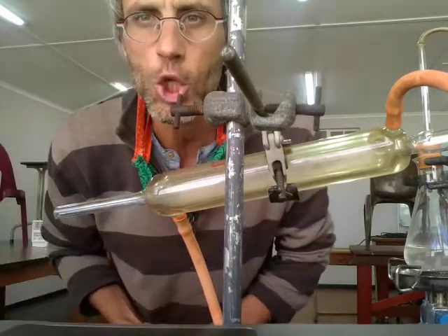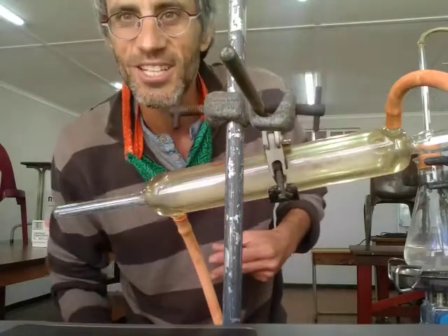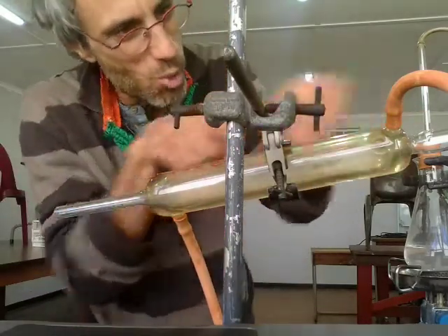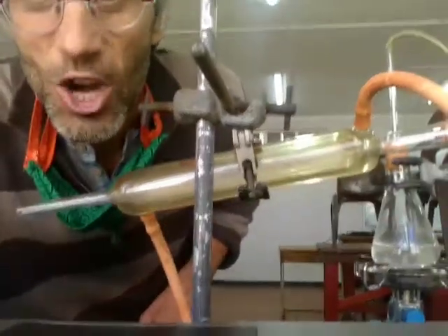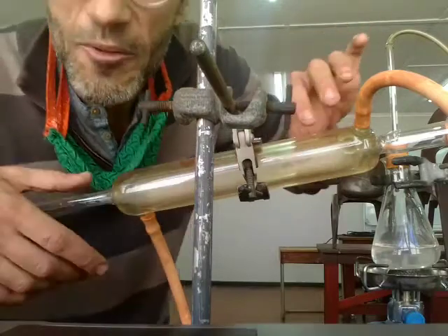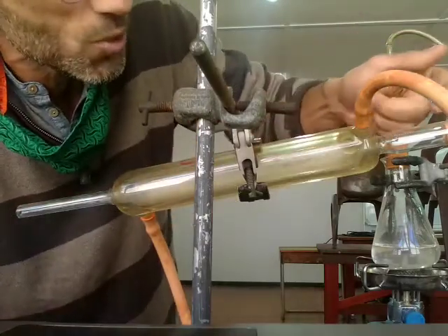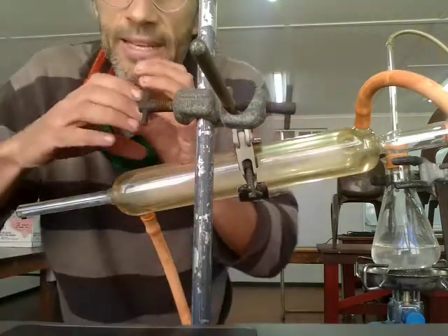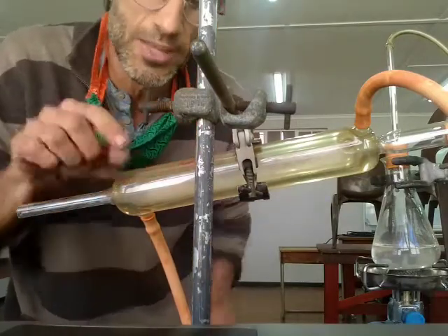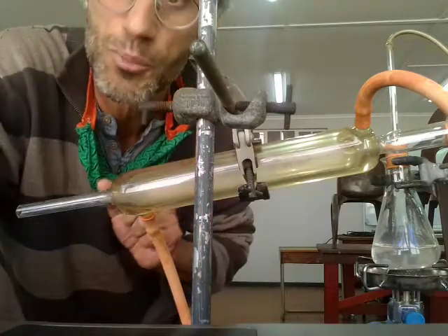How does the condenser cool the water vapor? Well, what we use is water. So we're going to pass water through the condenser to cool down the water vapor. But we can't mix the water we pass through the condenser with the water vapor that goes through the condenser, if you know what I mean. So the condenser has really two bits. It has an inside, like the shape of a cylinder, in the middle, where the water vapor goes through. Then there is a space, a gap, between that cylinder and the big cylinder. The water vapor goes through the middle, and in between the outer bit and the inner bit there is some space, and I'm going to fill it with water.